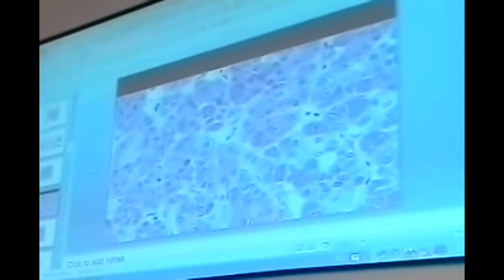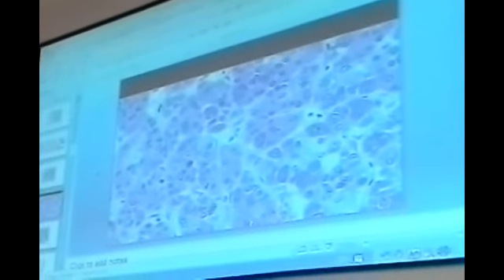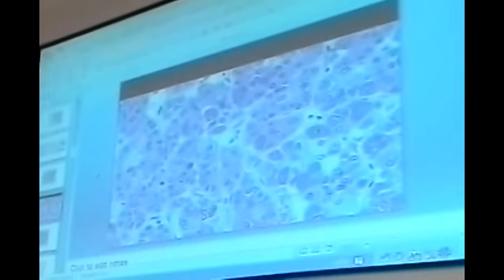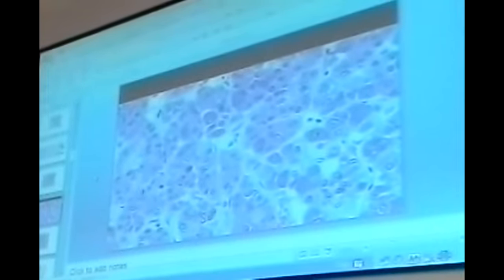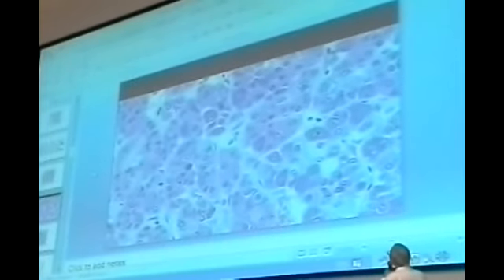What is the type of this section? Is it cellular? It's stained by hematoxylin and eosin, you see. Some of its cells are acidophilic and the others are basophilic. Yes. Are the cells different in sizes? Are some cells deeply stained and others small and poorly stained?